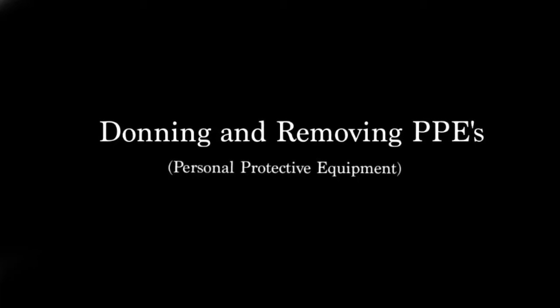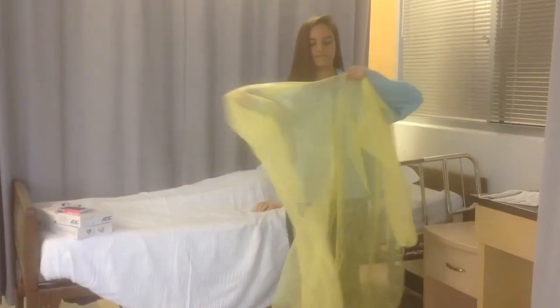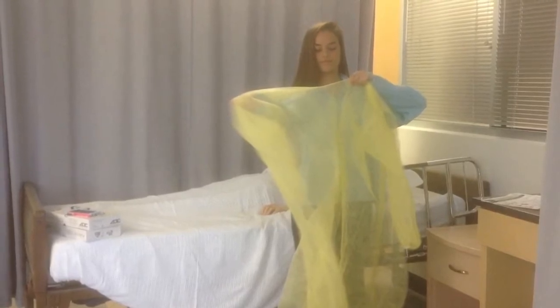Donning and removing PPEs. When donning, first you get your gown and make sure that it is facing front and the opening is in the back.